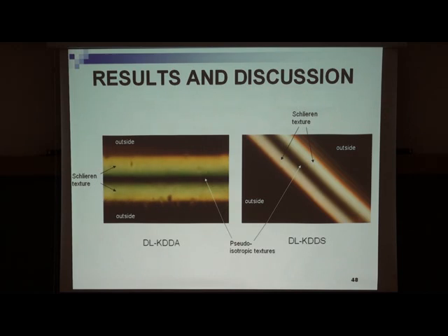Homeotropic, spontaneously aligned. Yes, but at the walls, the micelles should be aligned in contact with the walls. Yes, you are right. And the director is homeotropically aligned. And then in the center, you have a disclination line, no? Because you have this homeotropic alignment at the walls. So there is a defect here, because they cannot be gradually oriented. Okay, you're right.